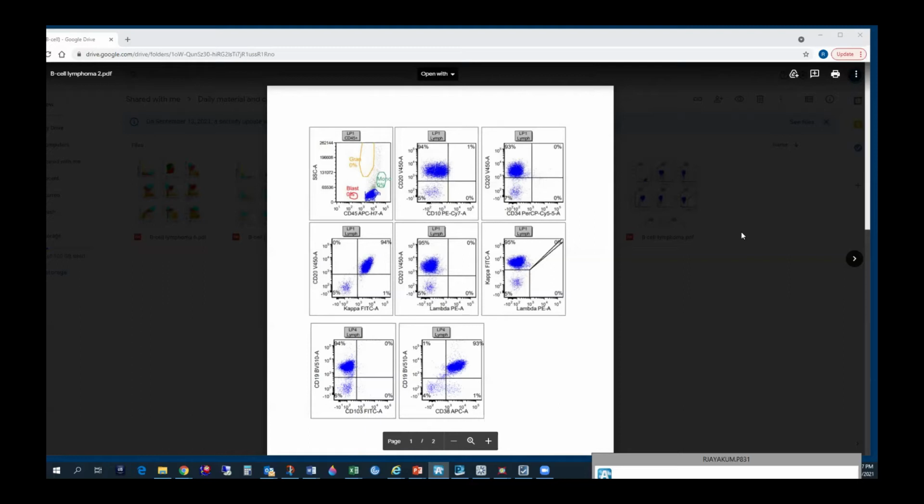Like, for example, if a patient is going from one institute to another with the report, not with the flow plots, and you say something is positive because it is more than 20%, but actually it is partial, there is some possibility to imagine that it is homogeneously positive in that population rather than being partial. So they avoided that term for that reason, to convey that.